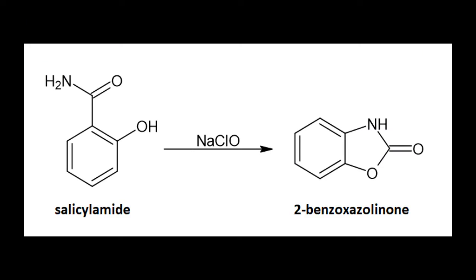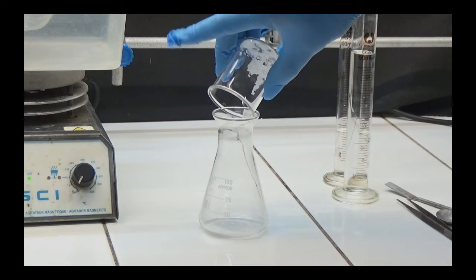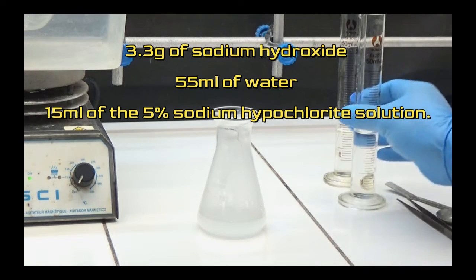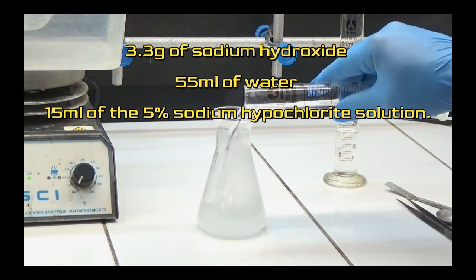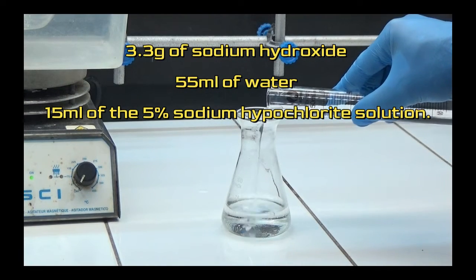After obtaining salicylamide, we will learn how to obtain 2-benzoxazolinone. The initial step is to make the hypochlorite solution. In a 100ml Erlenmeyer flask, I diluted 3.3g of sodium hydroxide in 55ml of water and added 15ml of the 5% hypochlorite solution.